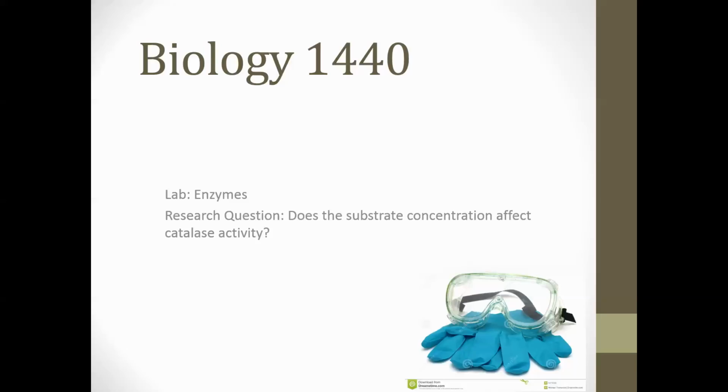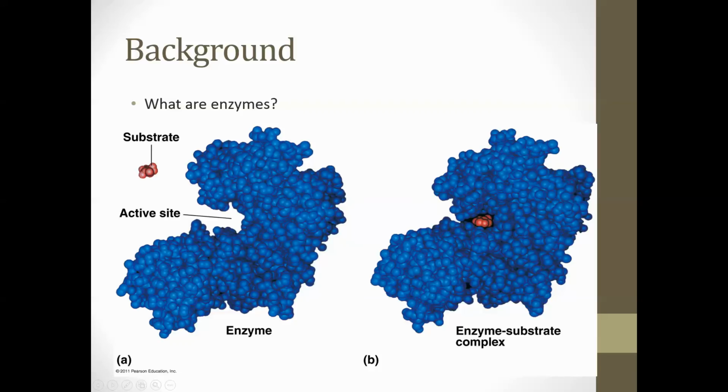This pre-lab covers experiments 4, part 1, part 2, and part 3 in your lab manual. In part 1, we're going to ask, does the substrate concentration affect catalase activity? So let's look into this. So catalase is an enzyme.